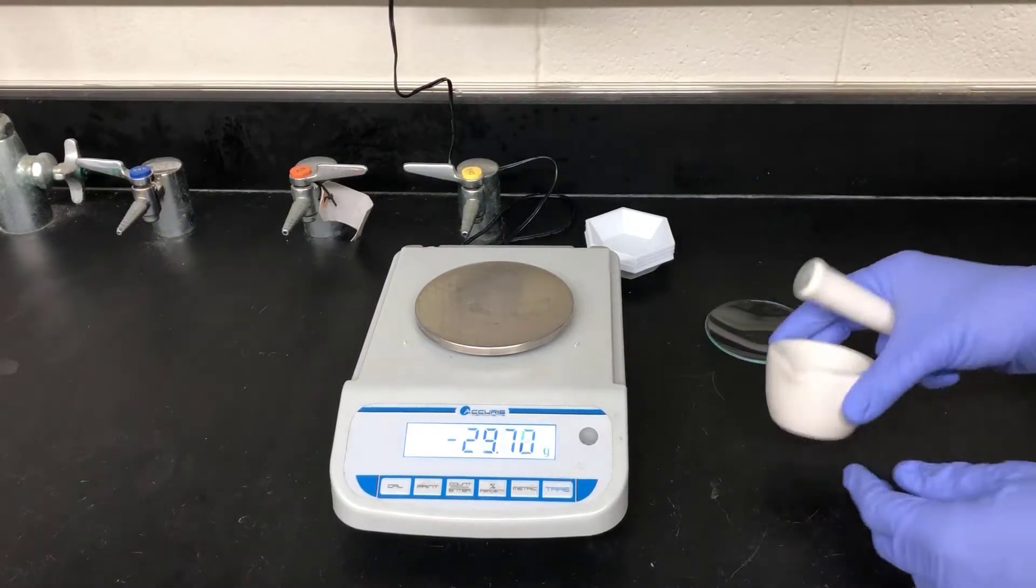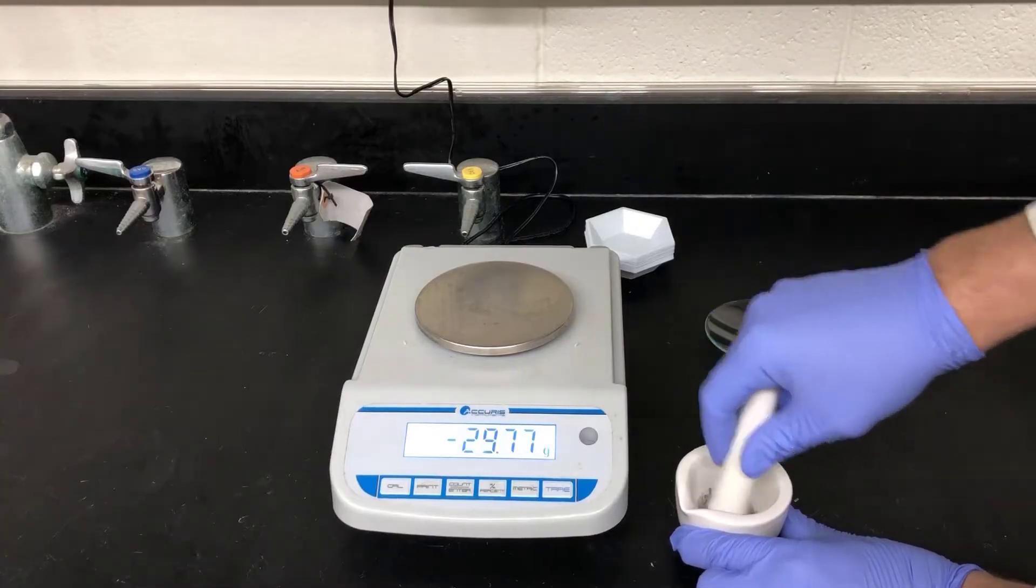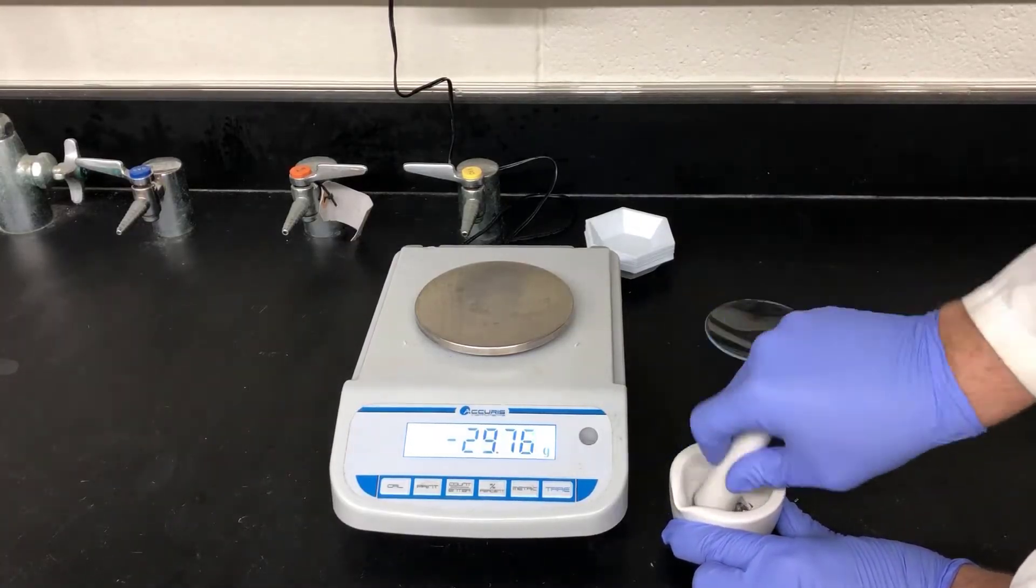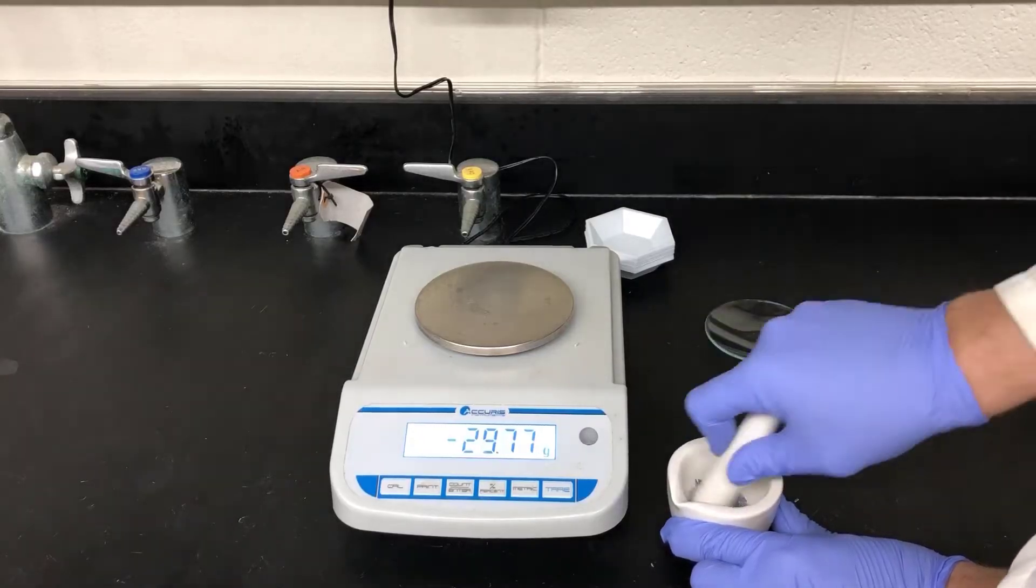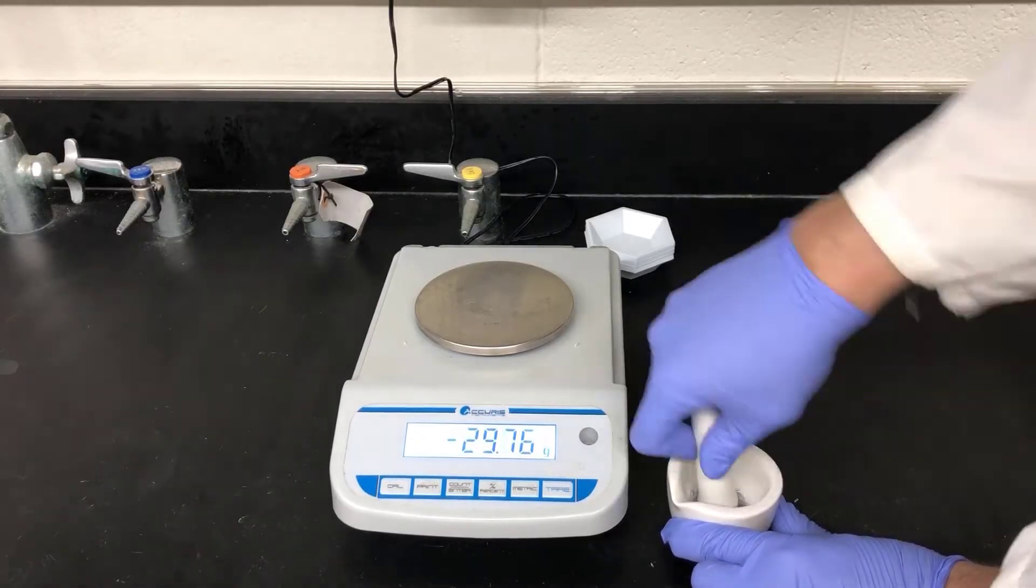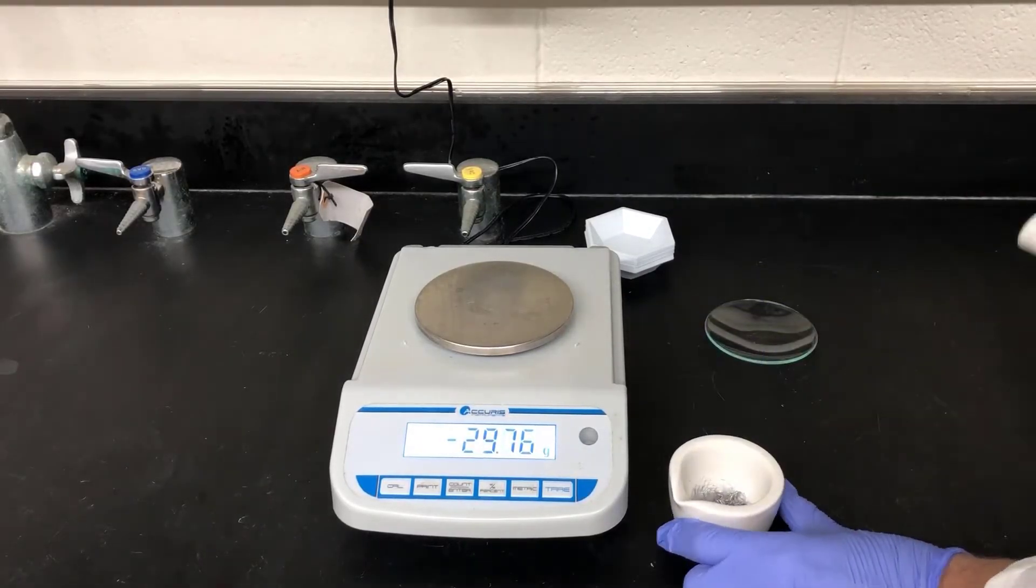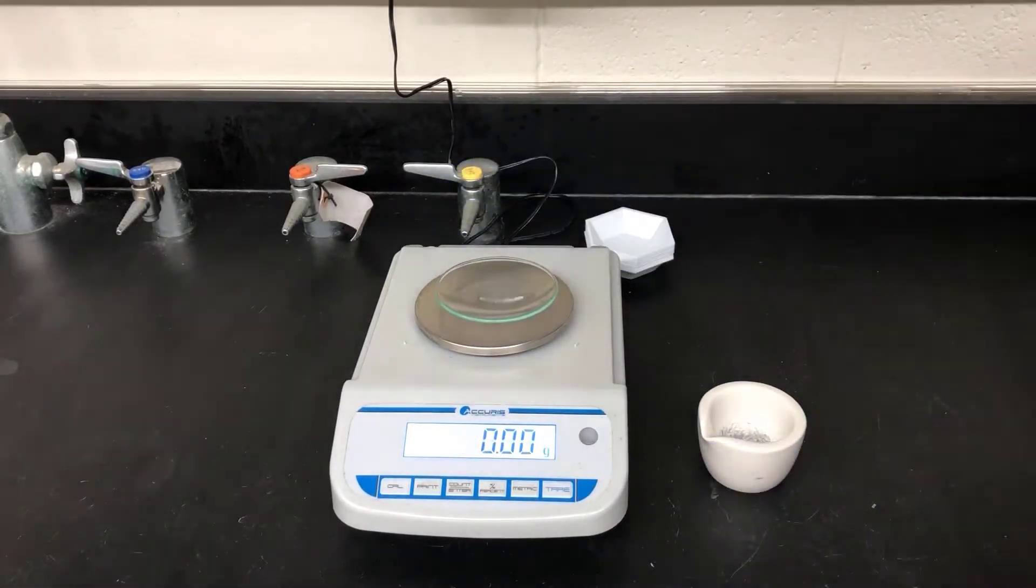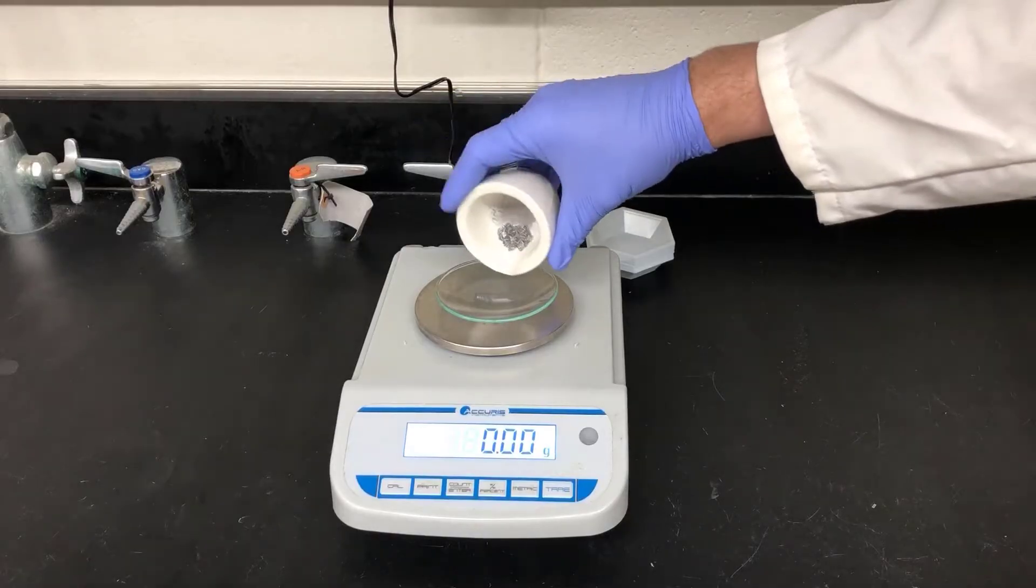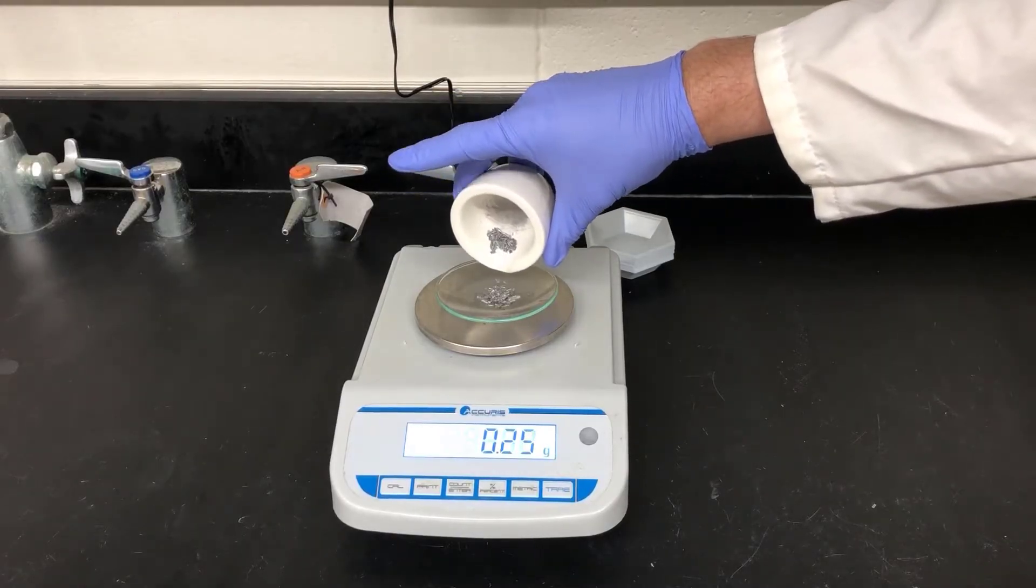The point of grinding the magnesium is to shine it up, exposing fresh metal surface. The Grignard reagent forms at the surface of the magnesium, and having fresh metal exposed is important in getting the reaction to go. Don't expect to powderize the magnesium, that'll never happen. Just shine it up, and crush the chunks a little bit if you can. Now I'll weigh out 0.60 grams of this ground magnesium to put in the reaction mixture.